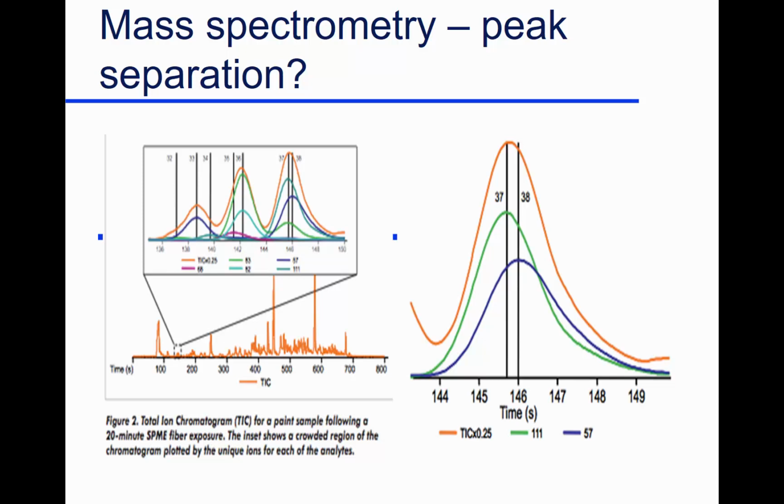Oh, these pieces here, they fit together for one molecule, and they then are here. Another set of pieces fit together for another compound here. And you can start detecting compounds and quantifying compounds without ever separating them. These compounds aren't separated by gas chromatography. But the detector learns and says, okay, these set of pieces, they're following, that's what I'm measuring. And so the neat thing is now, you don't have to separate compounds to measure them and quantify them. So we've got a tremendously powerful tool for separation, gas chromatography. Now we put together a detector that says, don't worry about it. If you separate it by 100th of a second, I can figure it out. And that's what makes it just tremendously powerful.